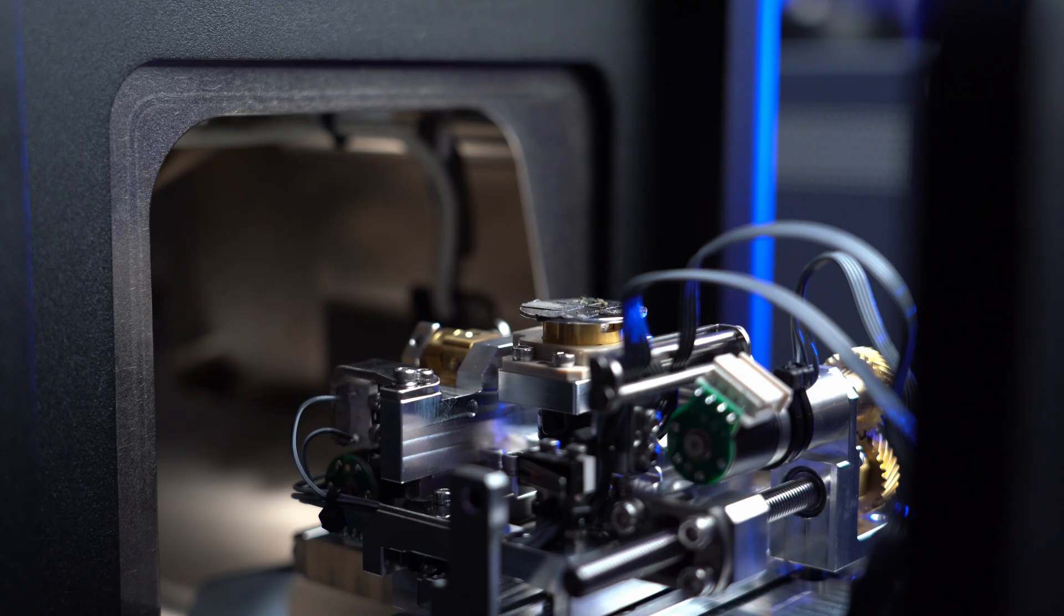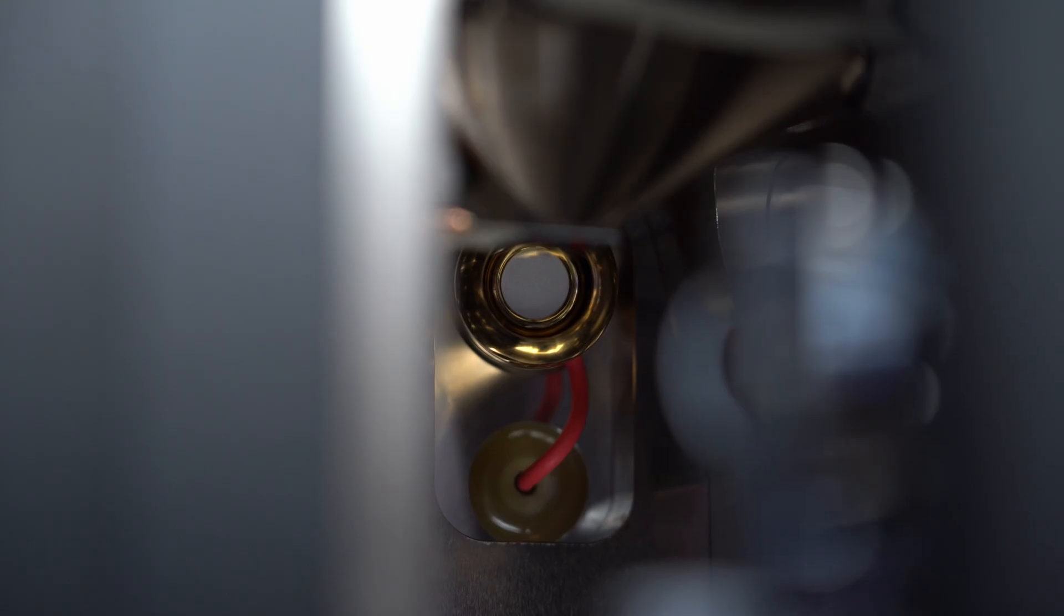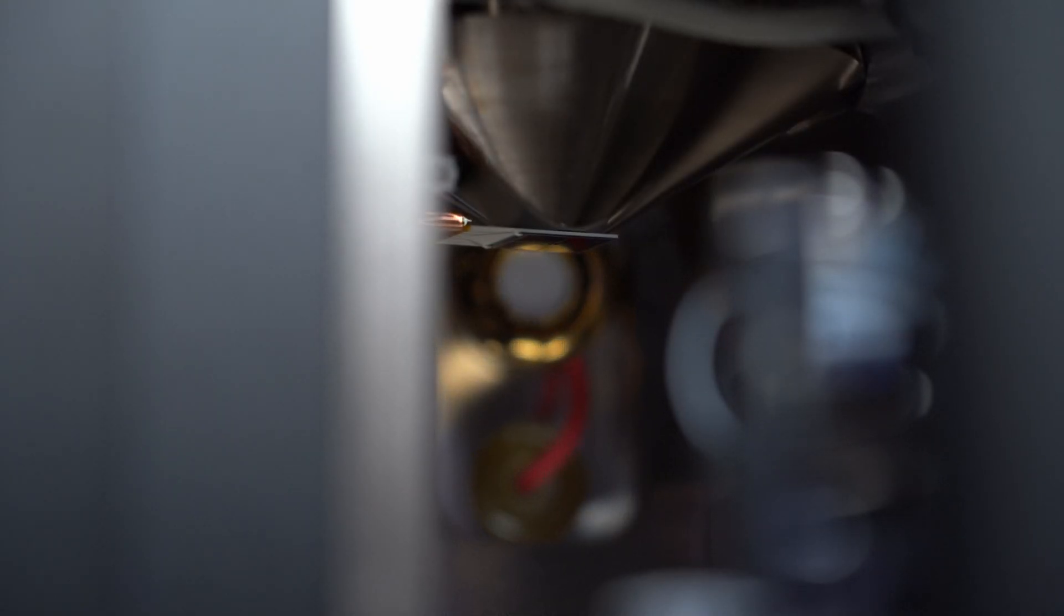So the upper part of the microscope forms an electron beam of correct shape, diameter, focus and deflects it to the desired point of the sample. The bottom part of the microscope is a sample chamber with motorized 5-axis stage and detectors that determine the flow of electrons and form a signal.